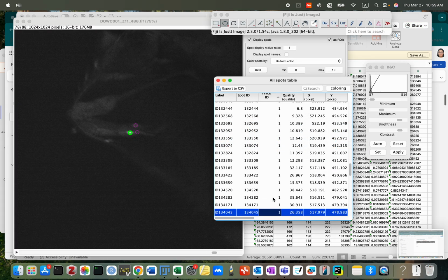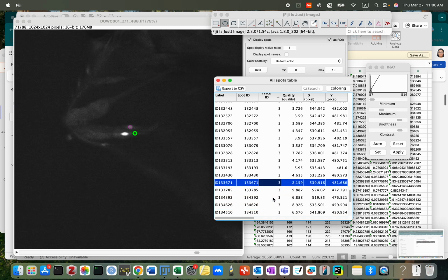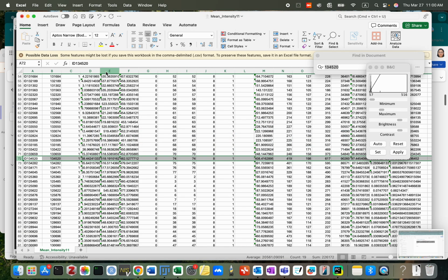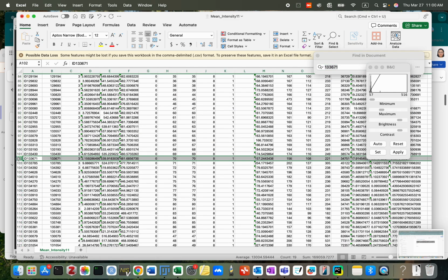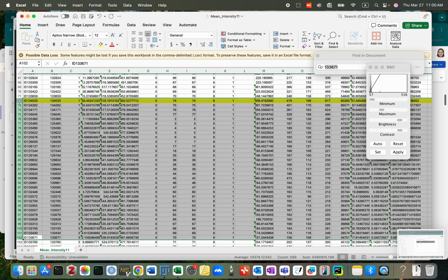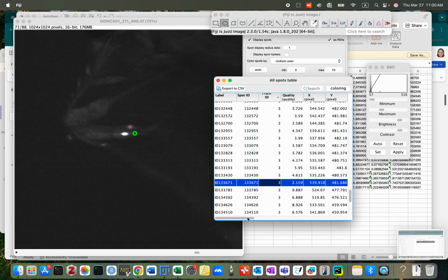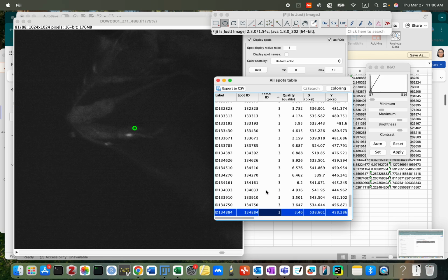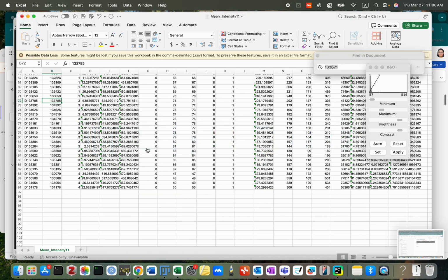Then let's see the next. And number 2 are wrong. 3. Until 1, 3, 3, 6, 7, 1. Be careful, this is a bit of a complicated stack, okay? Make sure you delete the correct one, yeah? 1, 3, 3, 7, 8, 5. This is correct. 4 are wrong. Okay.